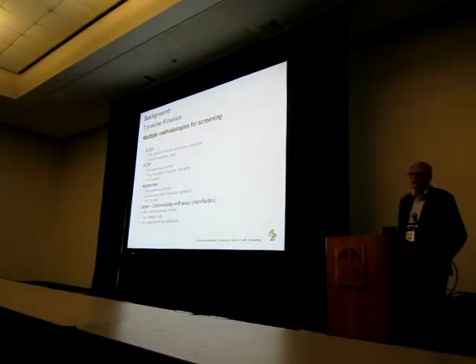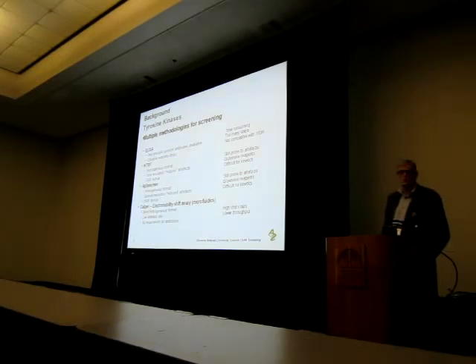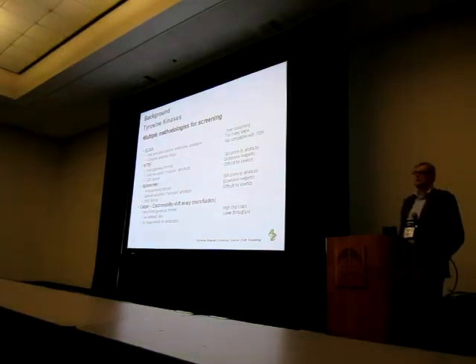And there's no requirement for antibodies. So it's not quite label-free. You still have to have a fluor on there, but it's getting quite close to being label-free. The downsides, of course, are that you have to buy the chips, and the chips are not cheap. So in England, we have a phrase, cheap as chips, but not these chips. These chips are actually quite pricey. So the throughput costs can be a bit prohibitive from an HTS perspective.